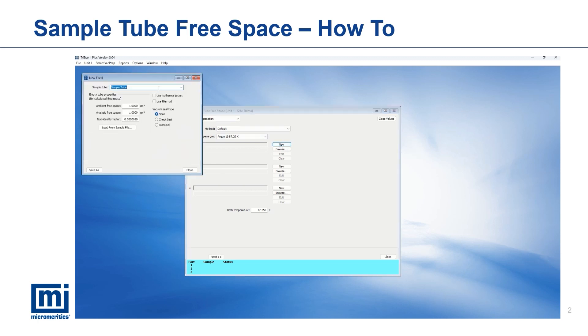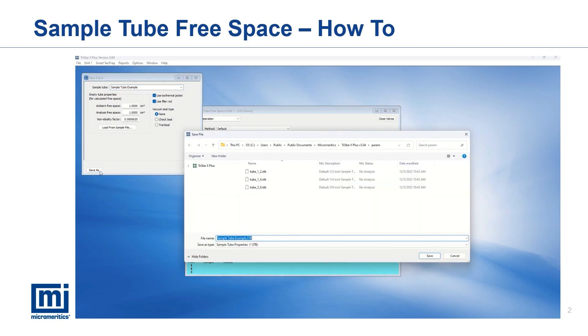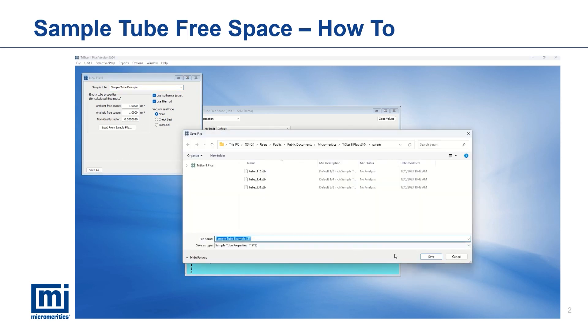Next, click new to create a new sample tube file, assign a name to the sample tube, and specify any accessories used. These do not affect the free space values and serve solely for reference.